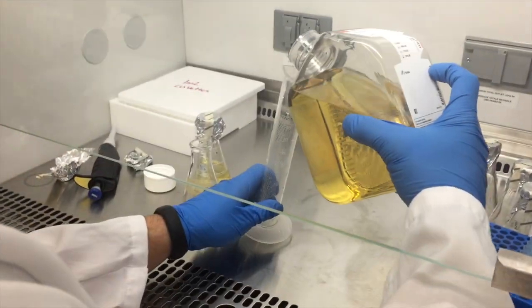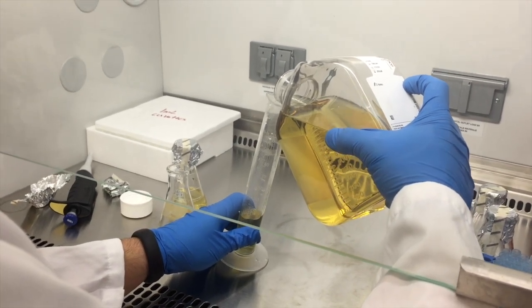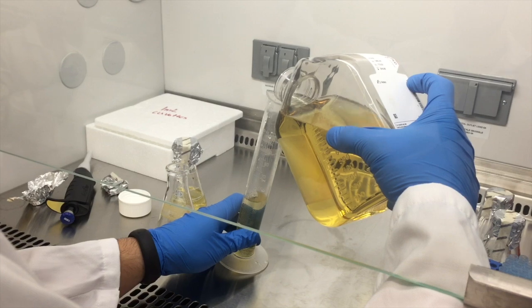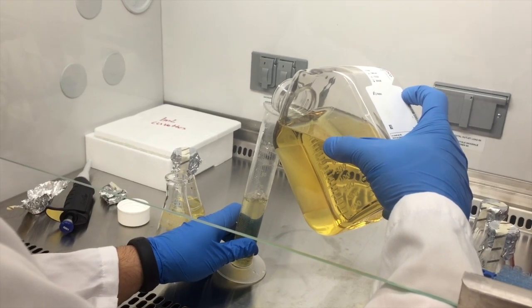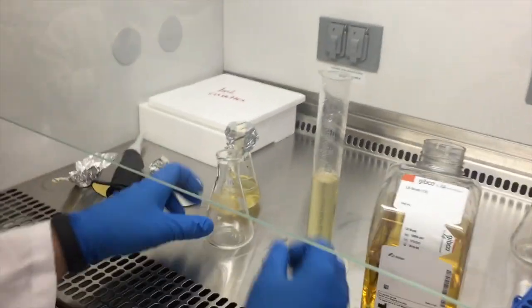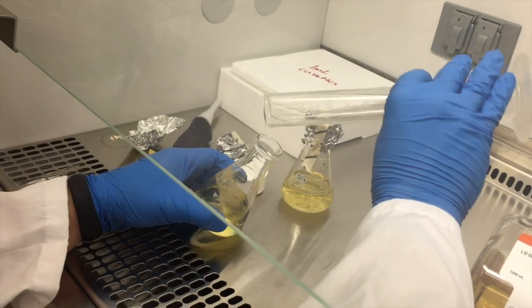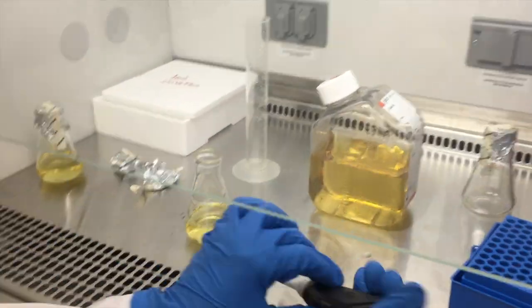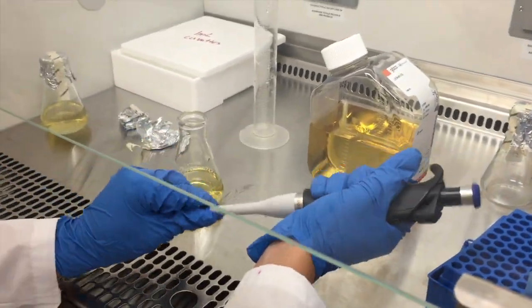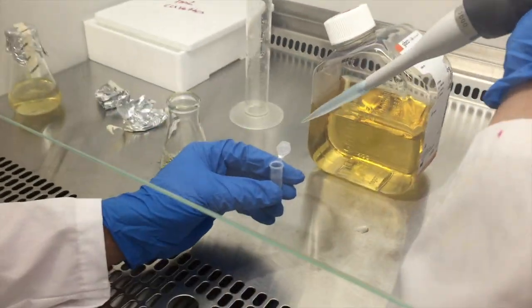In order to allow the bacteria to adapt to the media, it must be inoculated about 15 hours before running the reactor. Both reactors follow the same inoculation procedure. Measure 60 milliliters of room temperature media into a graduated cylinder and transfer to a 125 milliliter Erlenmeyer flask. Warm a sample of bacteria until it becomes liquid and pipette 1 milliliter into the flask.